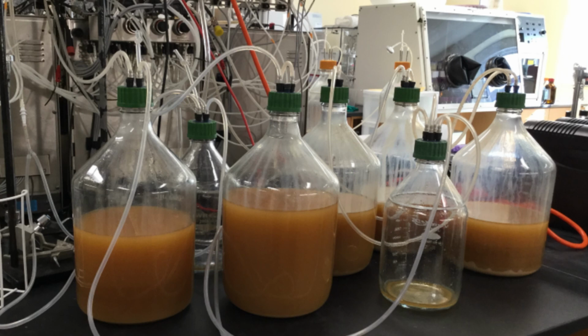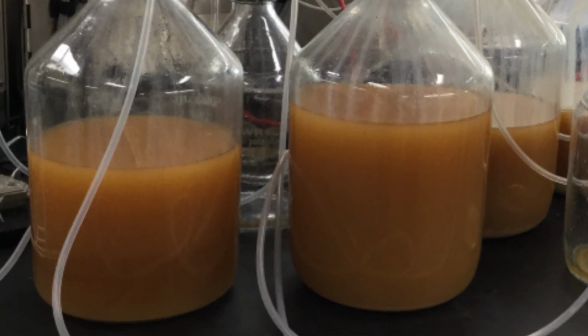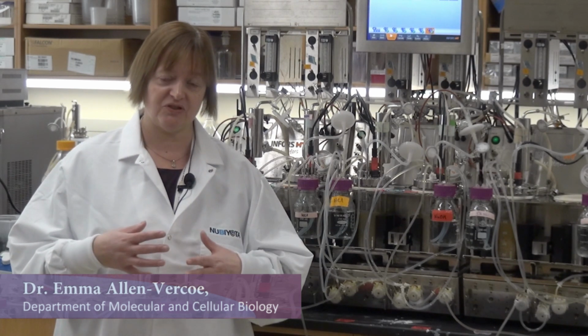Those waste products that are removed go into vessels at the back of here, and in fact those are really exciting vessels. They're full of what we call liquid gold, not waste, because that liquid gold contains an incredible assortment of microbial products, if you like, that are very, very important to understand how these microbes are working with each other and with the host itself. So we're very excited to be able to use this to look at the horse microbiome for the first time in this kind of context, to be able to understand how the microbes might be talking to each other and what in fact they might be doing in the context of equine health.